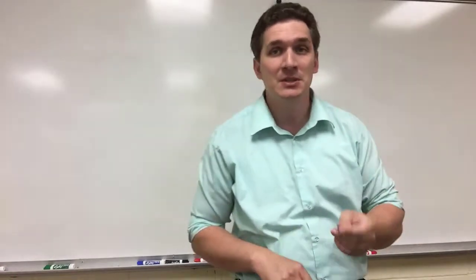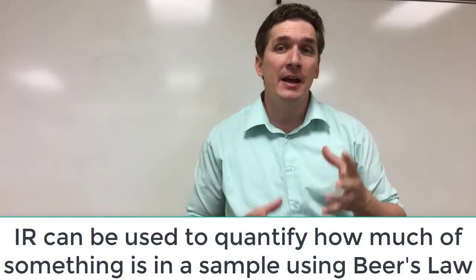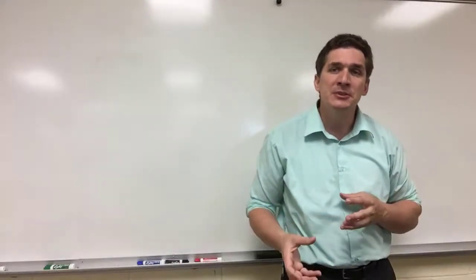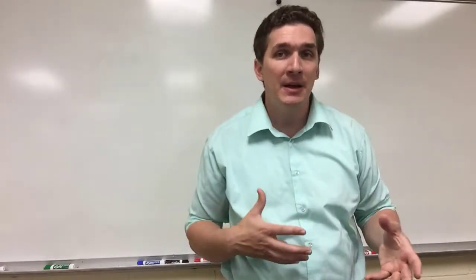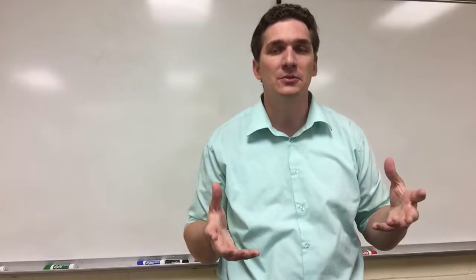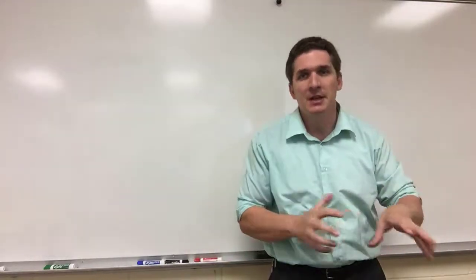We're only going to utilize one of them. So let's talk about the one you're not going to utilize, and this is quantitation. Because IR measures absorbance, it does follow Beer's law. And so in principle, we can quantify how much of a particular compound is in there, or how much of a given functional group we have, if we have a set of standards. That's a much more advanced technique.